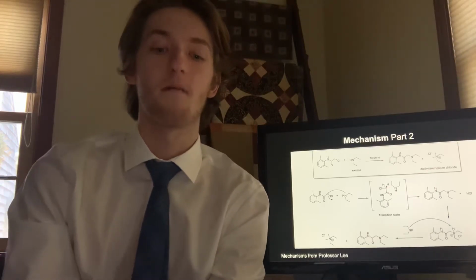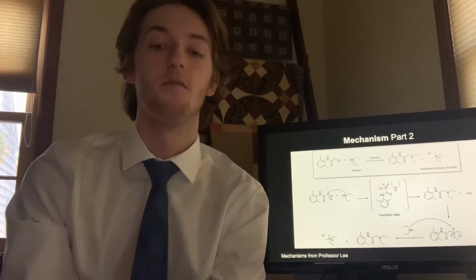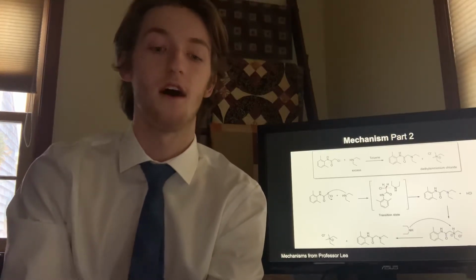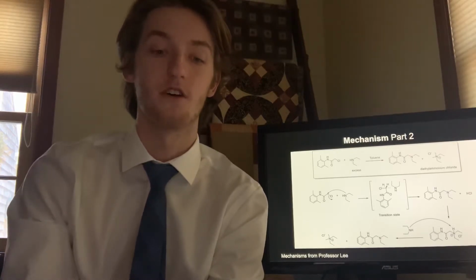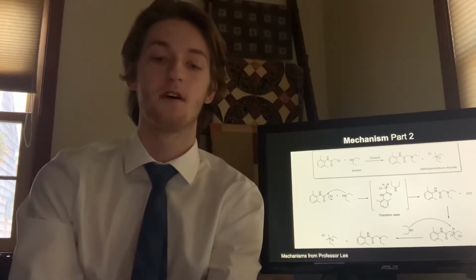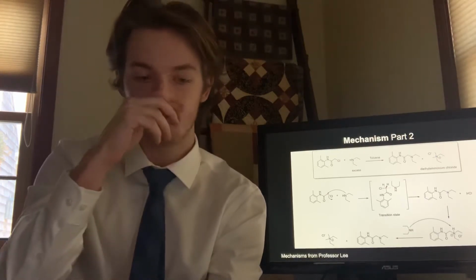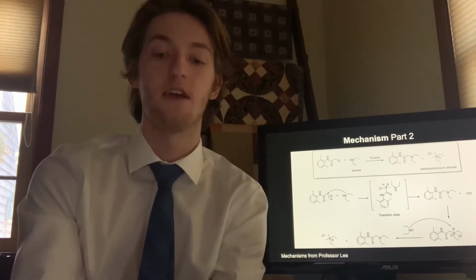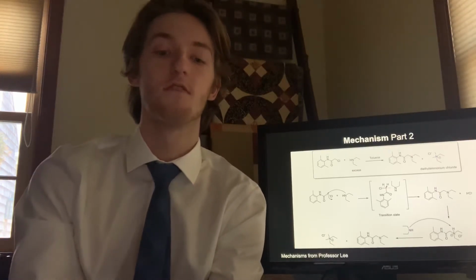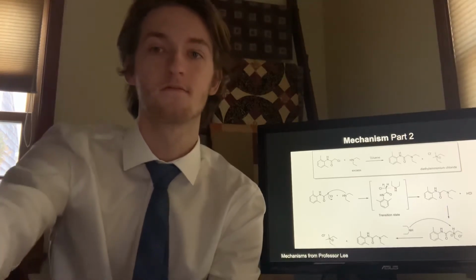The week 2 experiment ends with the liquid-liquid extraction using HCl followed by freebase with potassium hydroxide, producing lidocaine freebase, which is water insoluble. This second step creates a new 3rd-degree amine. Week 3 uses recrystallization using pentane in order to achieve a more pure version of lidocaine freebase because our lidocaine from the SN2 reaction is a very crude synthesis.